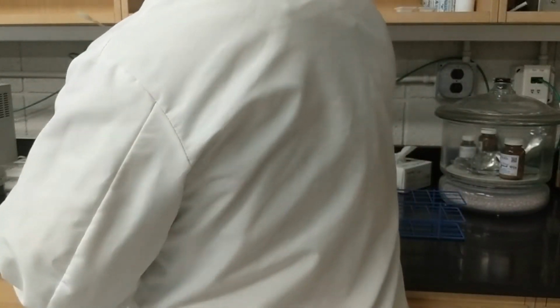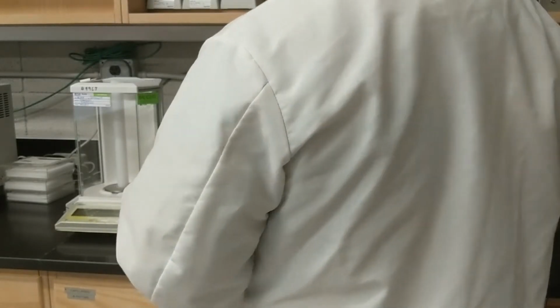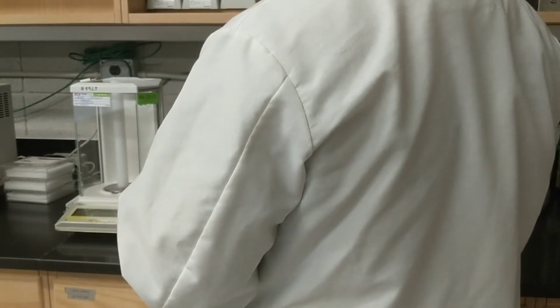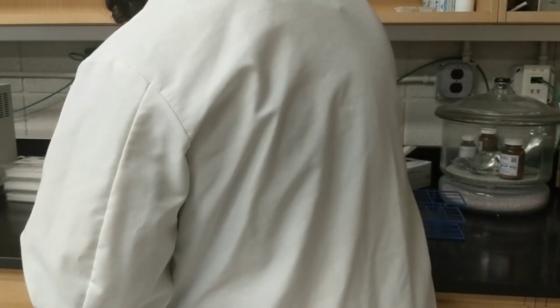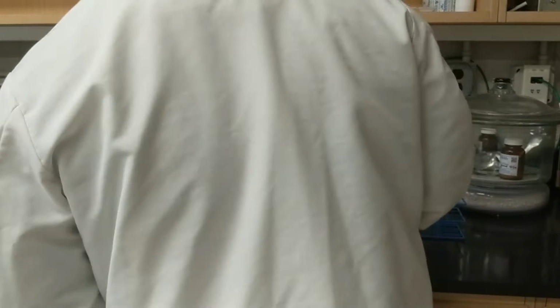For some samples that are sticky, viscous, or otherwise difficult, we may want to weigh directly into the tube. We do this often for our ICP-MS samples when we're testing food items, jams, jellies, meats. The point of this is that a lot of the time with the weigh boats, we can weigh accurately into the weigh boats, but then we can't transfer easily from the weigh boats into the tubes. So we use the balance in G025 for this one because it can support the weight of the tube itself, where the analytical balance in G021 actually won't hold the tube on its own.